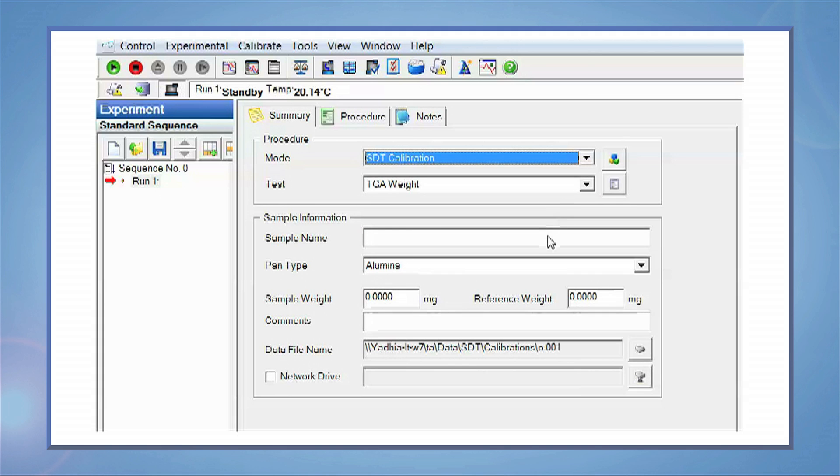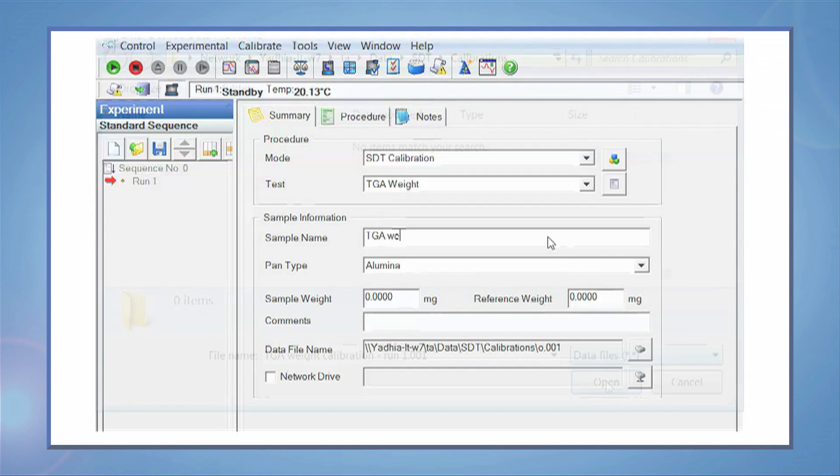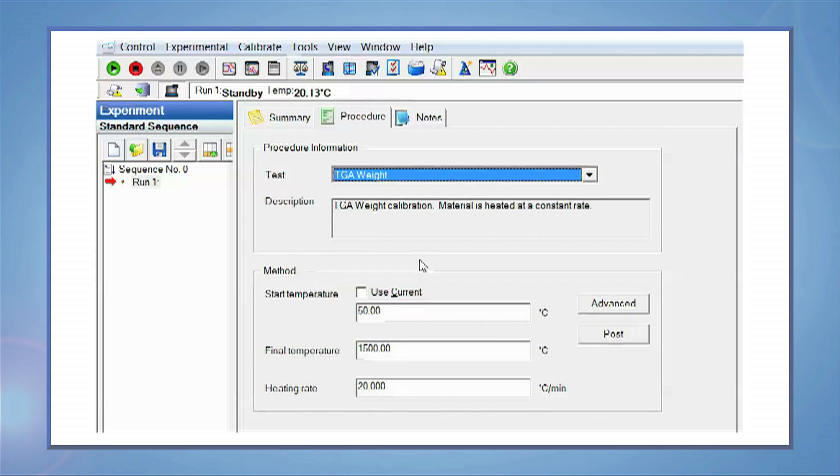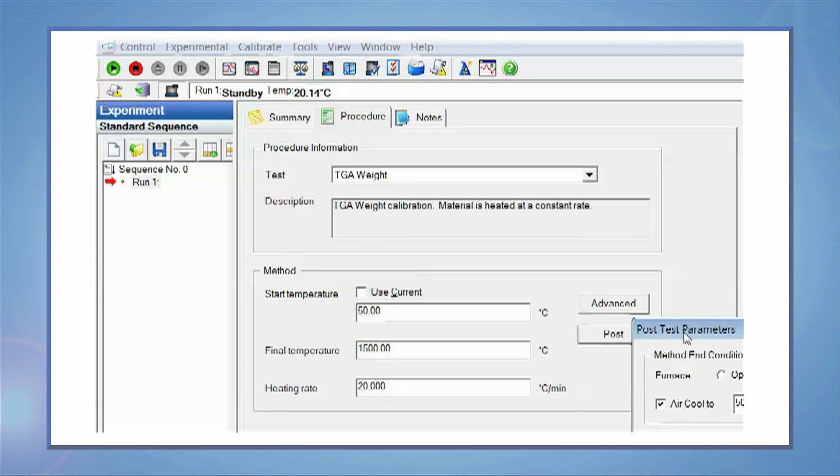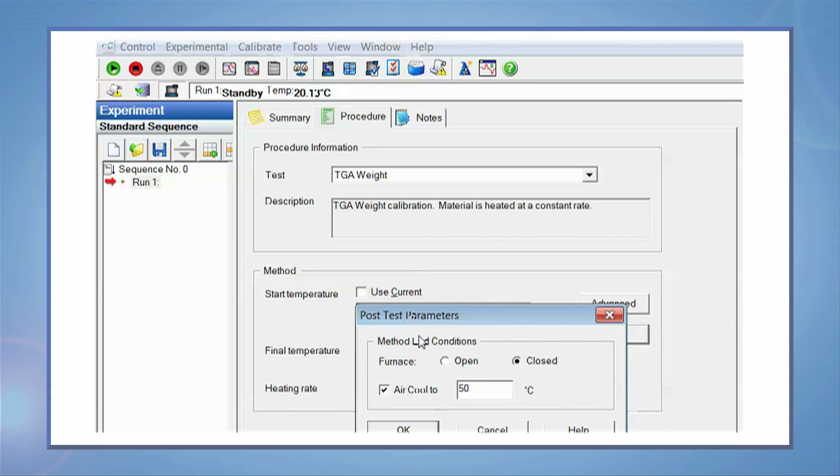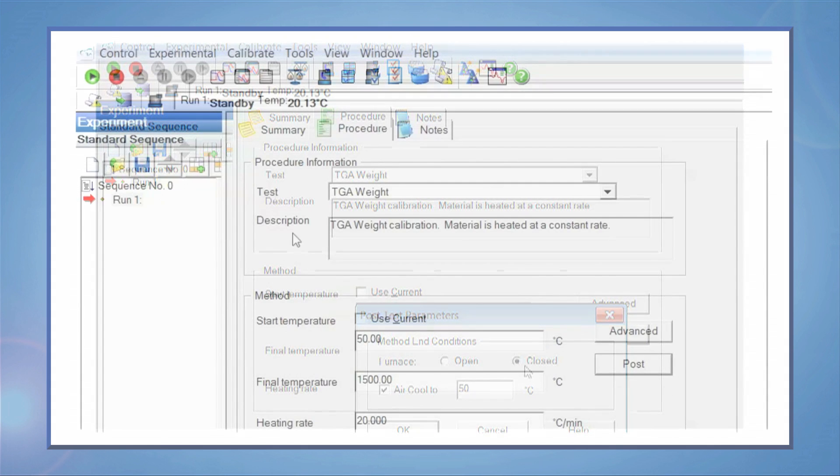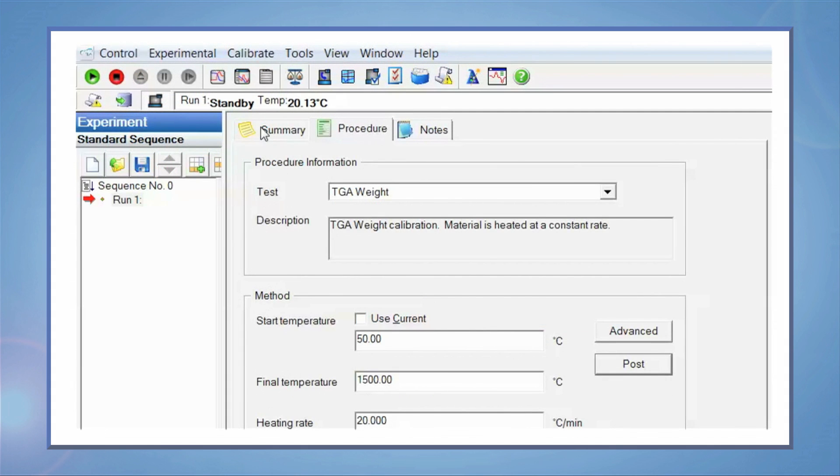Enter the sample information. Click the procedure tab. Enter the details based on your subsequent experimental conditions. Set the appropriate post-test conditions. Click on play.